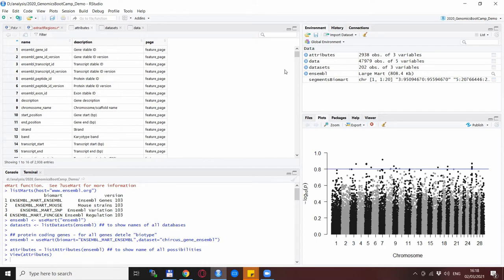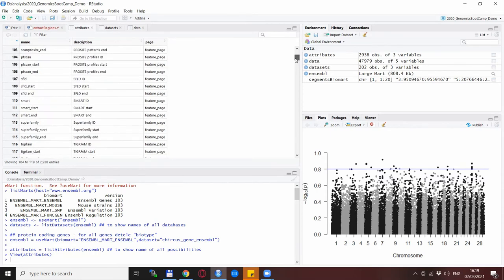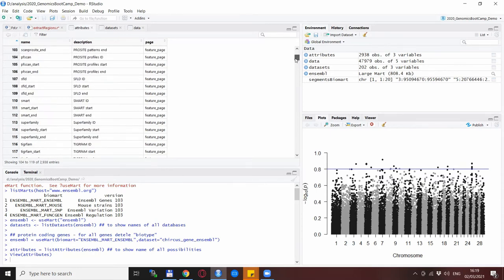But you can also notice that you could specify almost 3000 attributes for each genomic region so it is up to you which one you select. Of course you can select more than one attribute as we will do in our example.